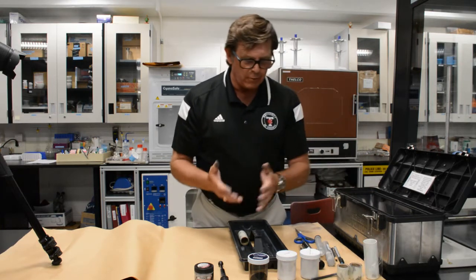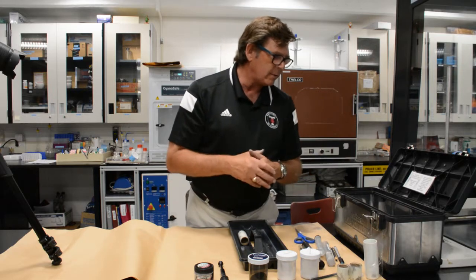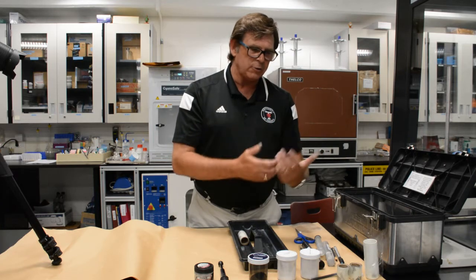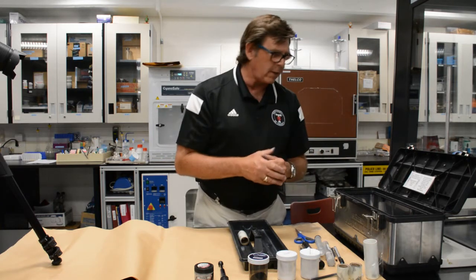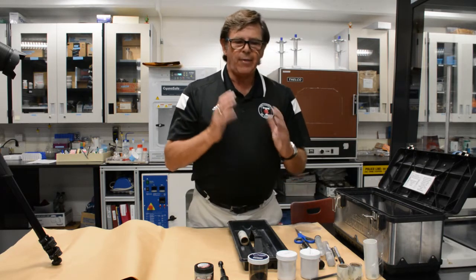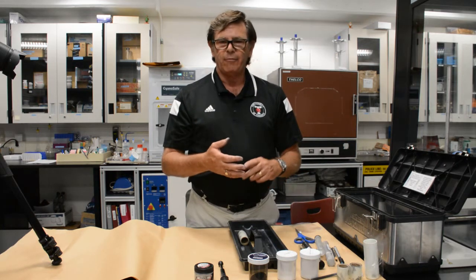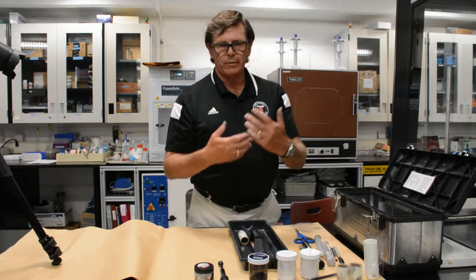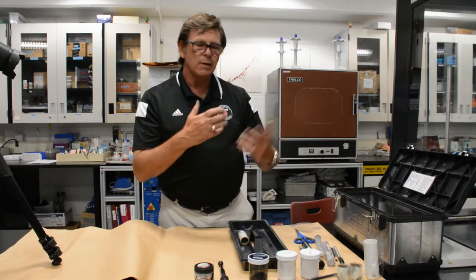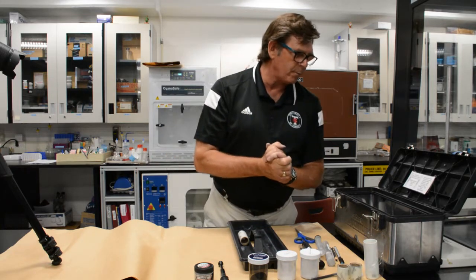As I said, there's going to be a variety of different sizes of tapes in there, so if you are missing tape or if there are issues with it, please let us know and we'll provide you with a replacement roll. And that applies to any of the consumable items that we have here, whether you're running out of fingerprint lifting tape, powders, or some of the other things that we're going to talk about. If they are consumed items and your supply is depleted, just let us know and we'll restock for you.